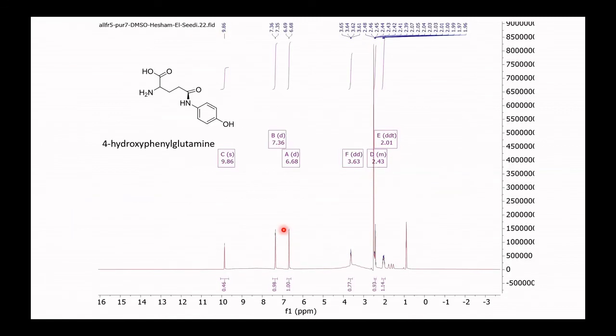Now we go again to another example of proton NMR and of the chemical shift. You can see that here is the aliphatic region until 6.2, aromatic region, functional group. So look at the assignment, proton, and the other proton, more deshielded. Why? Because it is alpha to the amino group. Now you remember it, right? Aromatic, do you recall it? This is the alpha to hydroxy. Hydroxy group is an electron donating group. So it means that it starts to be here.